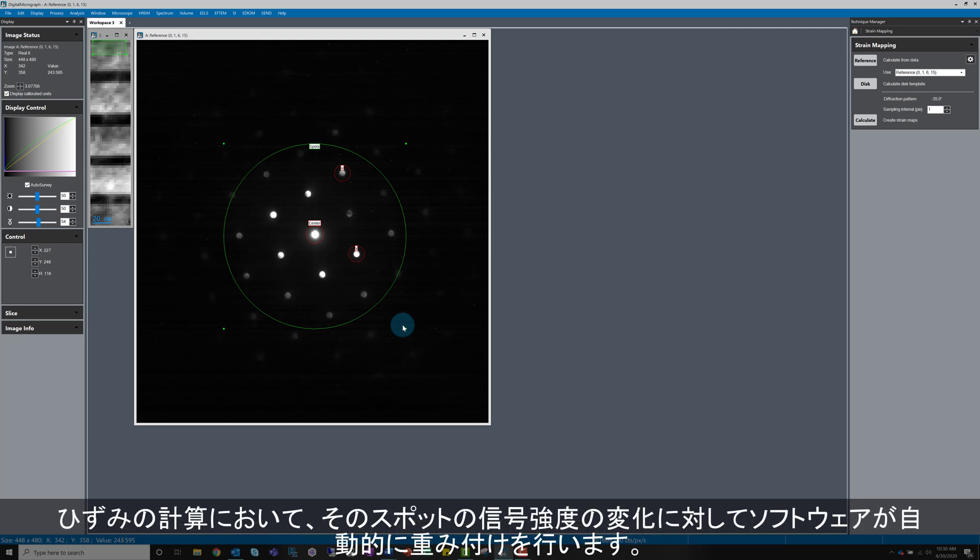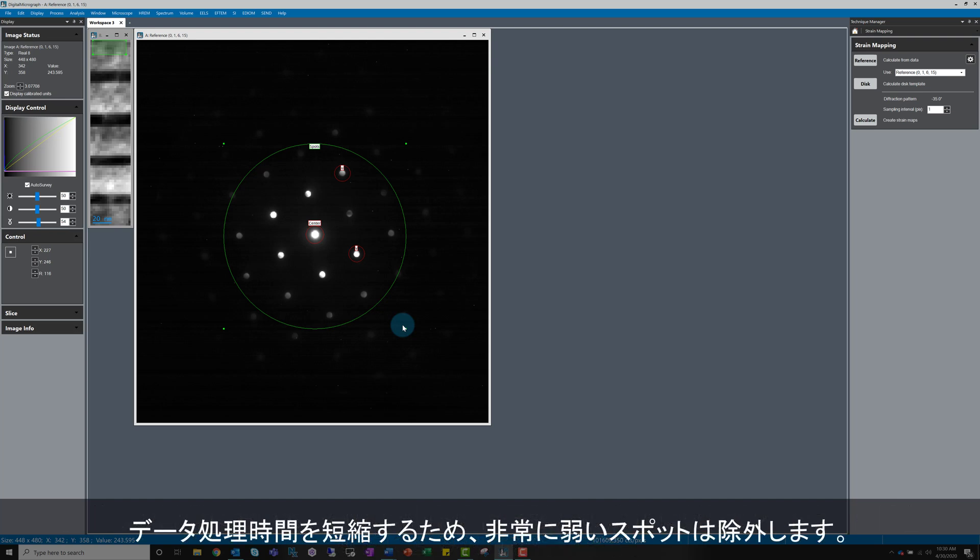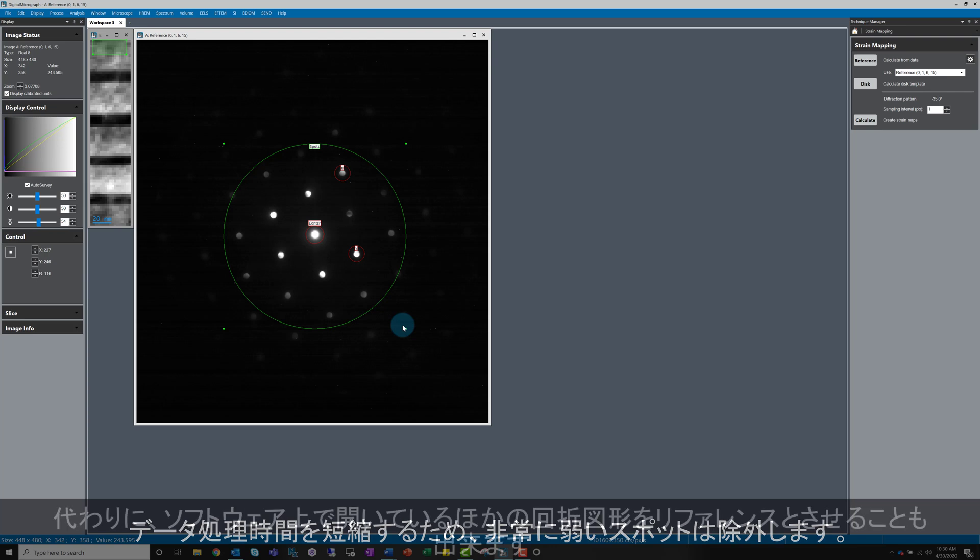The software automatically weights the effect of the spots in the strain calculations based on their intensity, but the very weak spots should just be excluded as they just increase the data processing time and don't improve accuracy in the result.